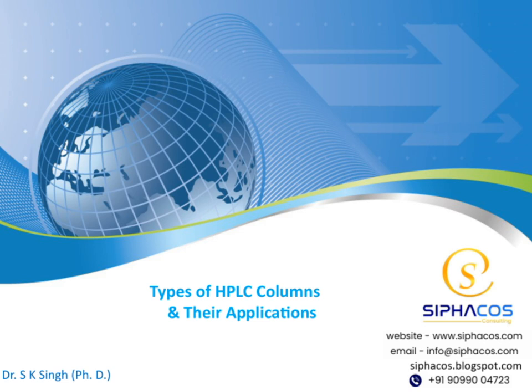Today, we will be exploring the fascinating world of HPLC columns. The topic is types of HPLC columns and their applications. Over the course of this session, we'll look at different types of columns used in HPLC and discuss how each one is applied in various analytical scenarios. I'm excited to share this knowledge with you, so let's get started.